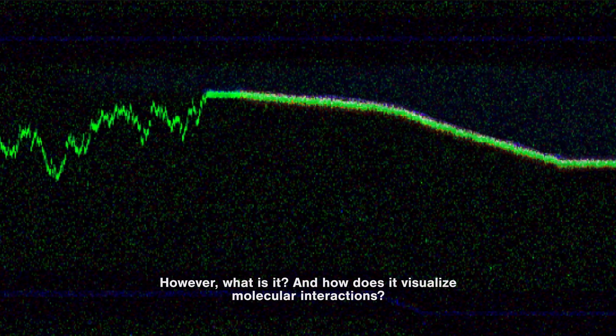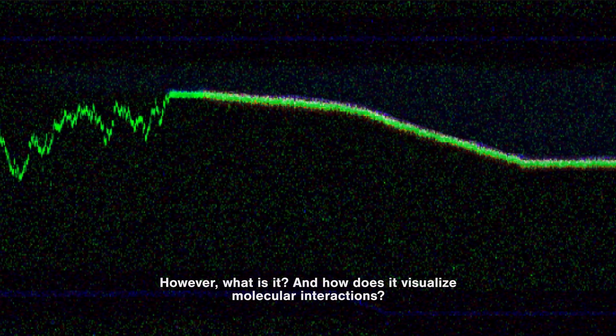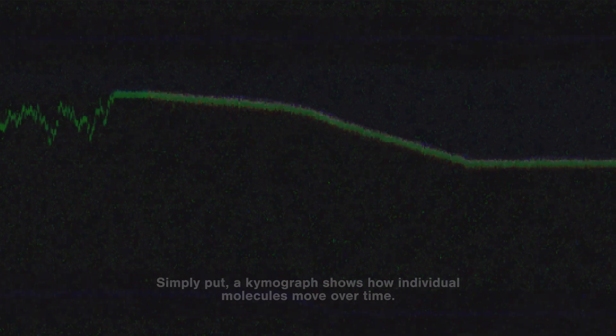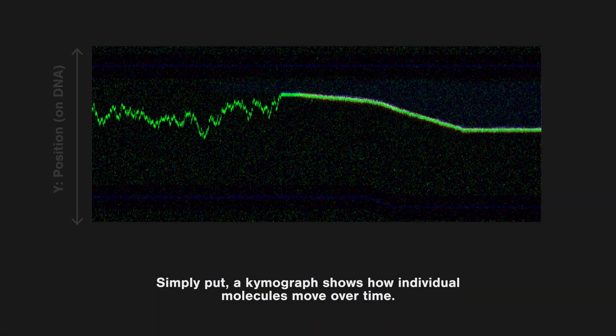However, what is it? And how does it visualize molecular interactions? Simply put, a kymograph shows how individual molecules move over time.